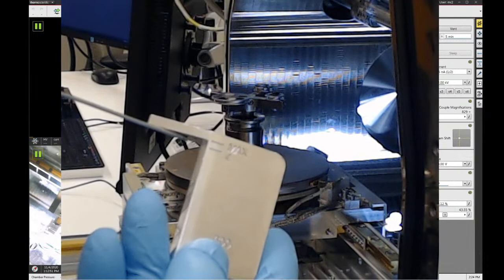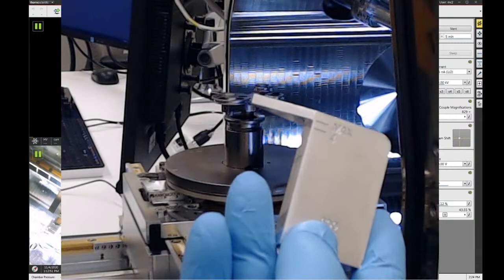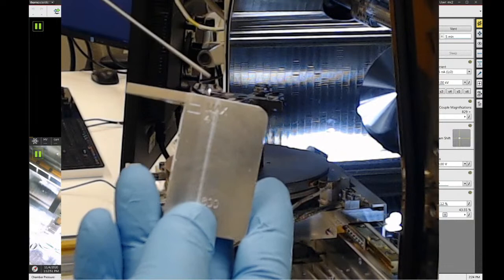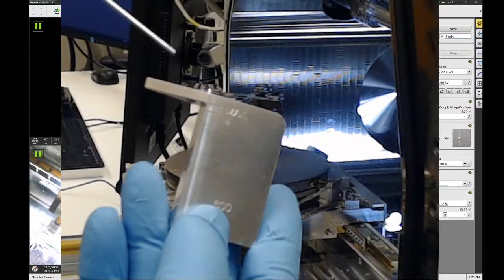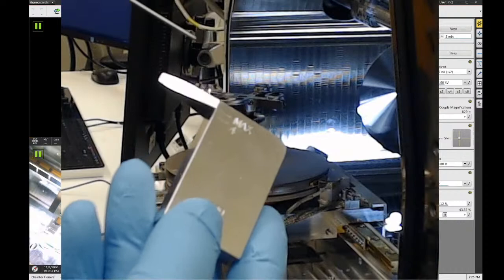And then the max height here actually refers to maximum resolution, but that's for 1 millimeter working distance. So if you're right at this point, you're actually 11 millimeters away from the lens. So you're still a long way away from crashing into anything. The top part of this gauge doesn't mean anything. I think Thermo Fisher kind of missed an opportunity here. They could have made that surface relevant. But you can actually have samples that are a little bit taller than this, and they're still okay to load into the microscope. Unfortunately, this gauge doesn't tell you if your sample's too tall. It just tells you if your samples are too short. So try to err on the side of caution. Make your samples just taller than the max line, and you should be safe. You should have about 10 or 11 millimeters of clearance below the lens.